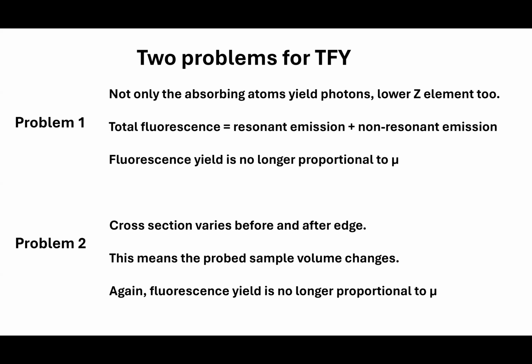When we measure the manganese L-edge, we tune our X-ray energy starting from 600, going over the L-edge of both L3 and L2, let's say from 600 to 700. We go through the whole range and scan, and we also collect the outgoing fluorescence photons. We get a spectrum.